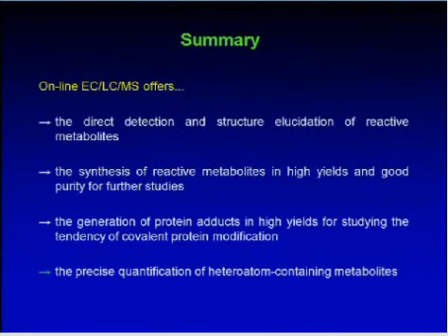So for fluorine, it's very unfortunate that this is not possible by ICP, because the limits of detection are extremely poor. You can see it under certain conditions, but you can certainly not see it in concentrations which are relevant for these studies. This is simply due to the chemistry in the plasma, because you just kind of take out one electron thermally. I mean, if you heat a compound, you just emit electrons, so you come to the cation, and the cation itself will not be formed easily by the electronegative elements. Thank you.